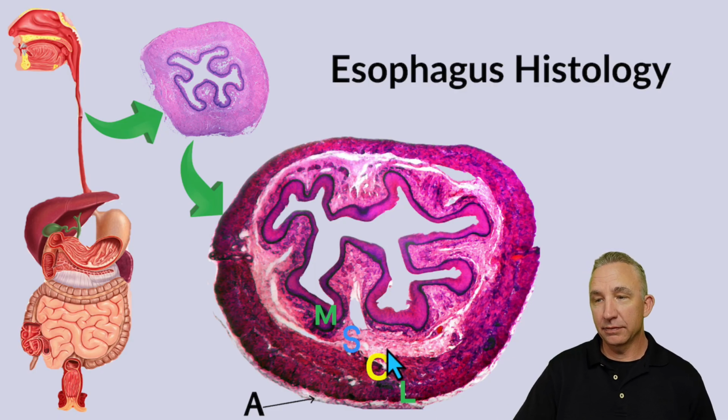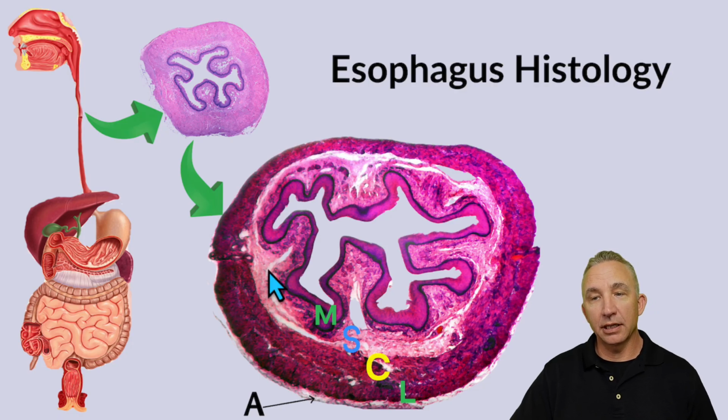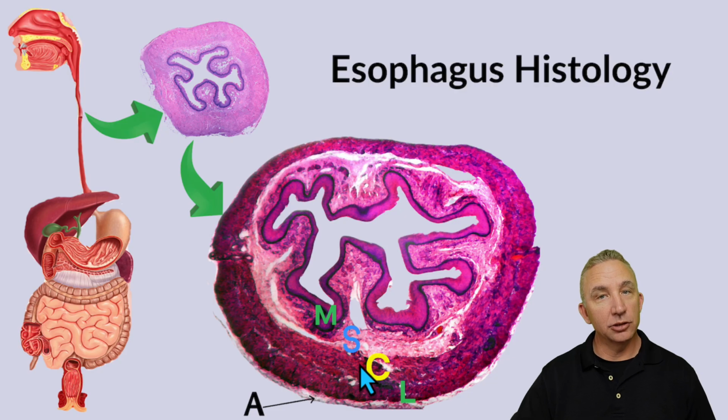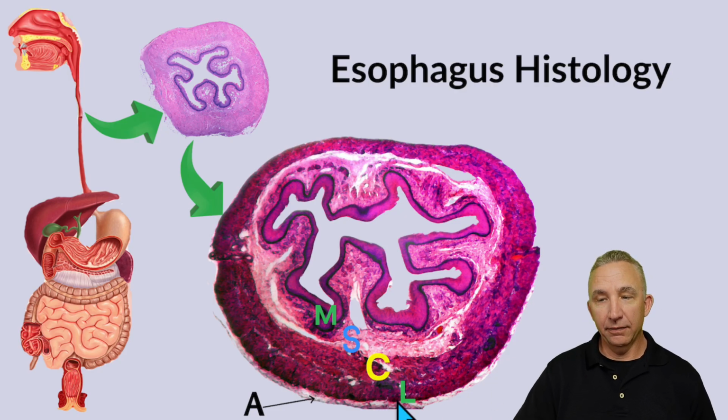So this is connective tissue. Depending on the organ, we will see different structures, but I see a lot of blood supply to help provide that to my epithelial tissue. So I have submucosa referring to the S. So everything past my muscularis mucosae, this is all submucosa, which is primarily connective tissue. Submucosa. And then I get into my muscularis externa, 2 layers, C for circular, L for longitudinal.